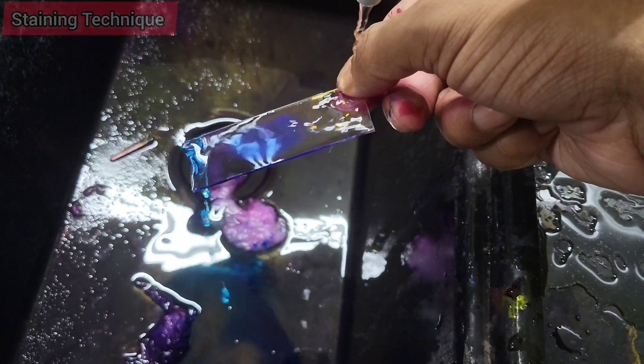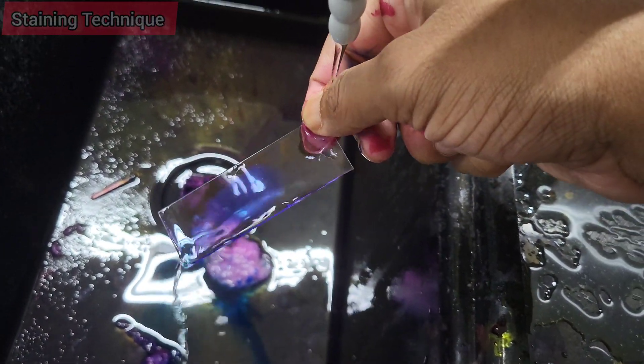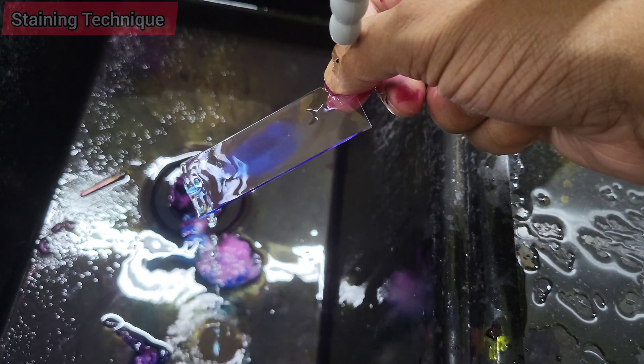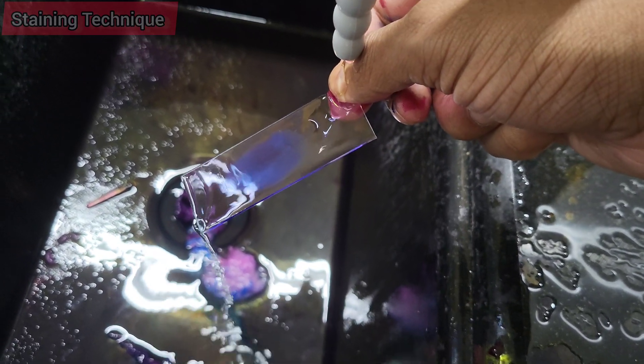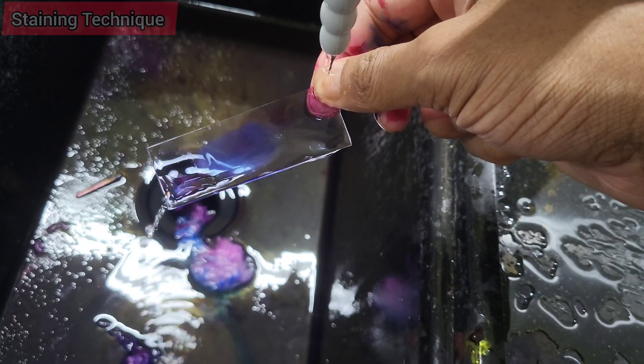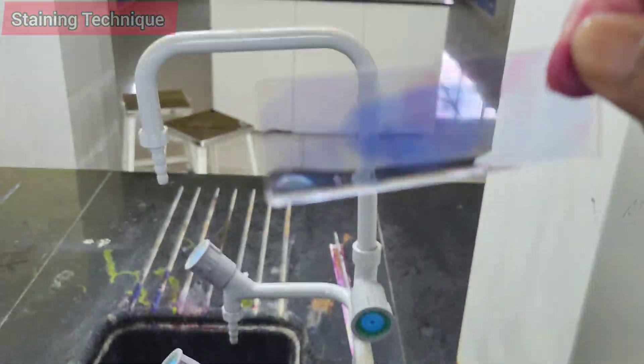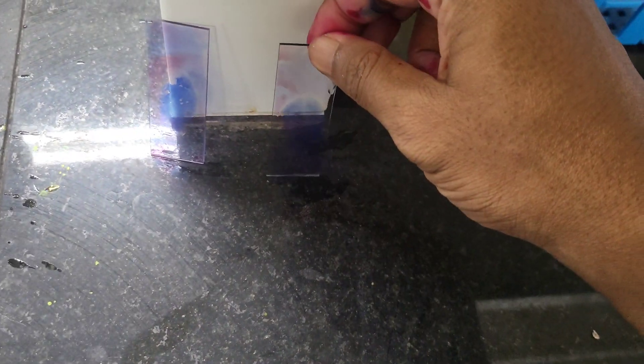After 30 seconds to one minute, rinse the slide gently with tap water and let it air dry and observe under oil immersion lens using a microscope. Acid-fast bacilli appear as brick red or pink color in blue background. Acid-fast bacilli may be sparsely distributed so we have to examine the entire slide.